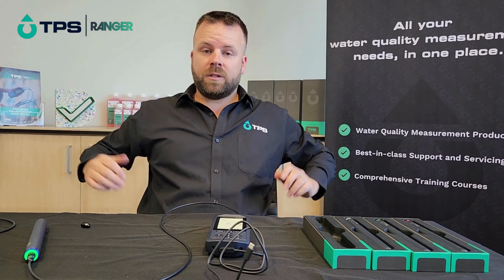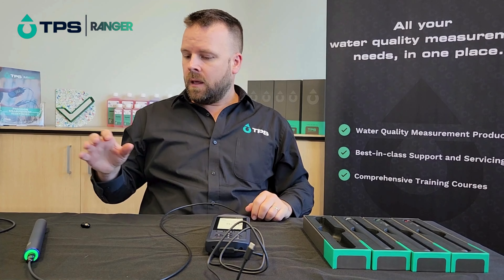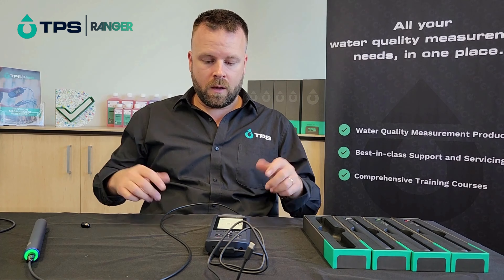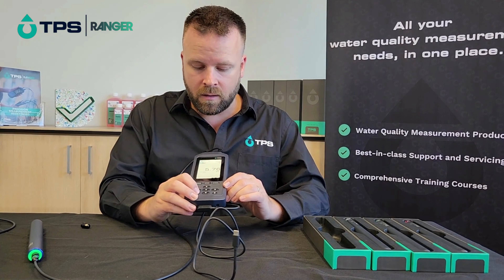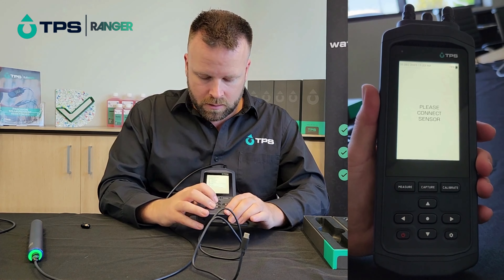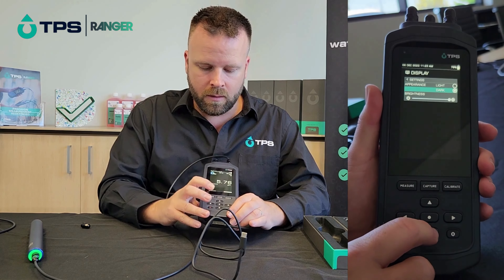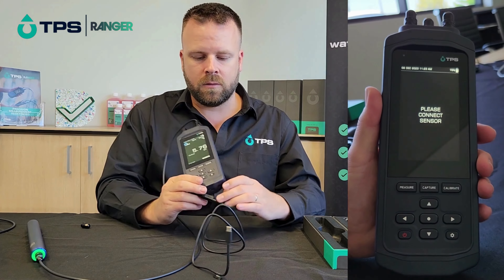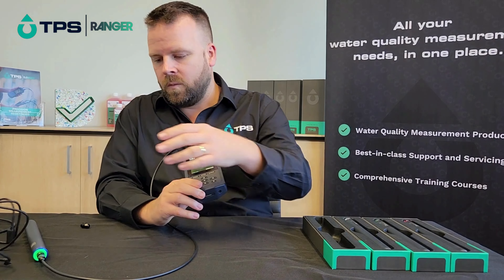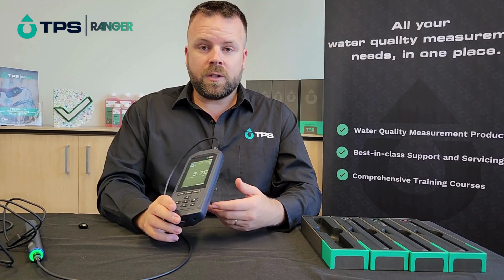That's pretty much it — that's how to get up and running with your instrument. You can plug in whichever sensors you have, get them calibrated, and go ahead and start taking readings straight away. One more setting I do want to show you: if we go into the display, we can change the background to dark mode, which is nice and easy on the eyes and looks really good.